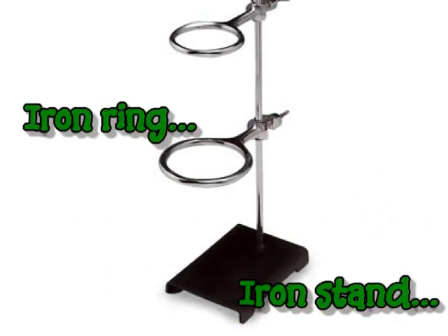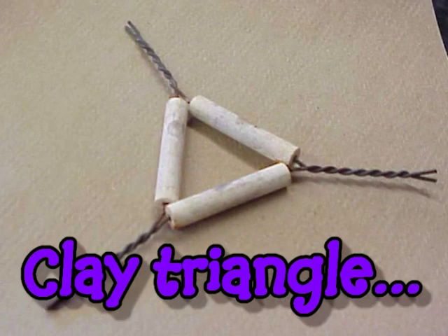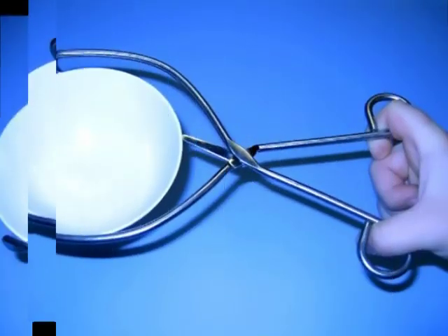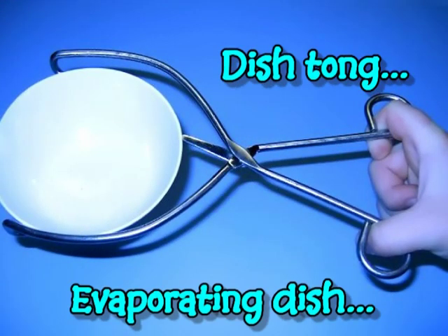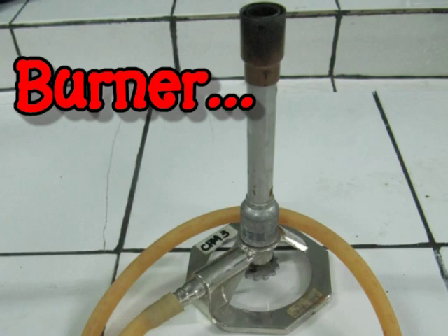We also need an iron ring and iron stand, a clay triangle, an evaporating dish and dish tongs. Next is the burner — in heating the contents of the evaporating dish, we will definitely need a burner.